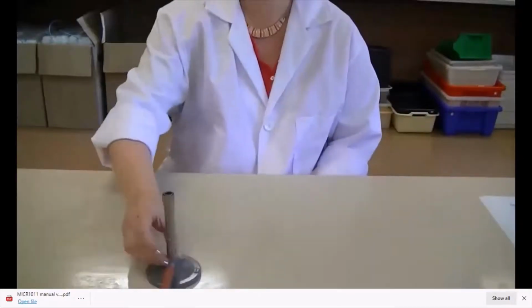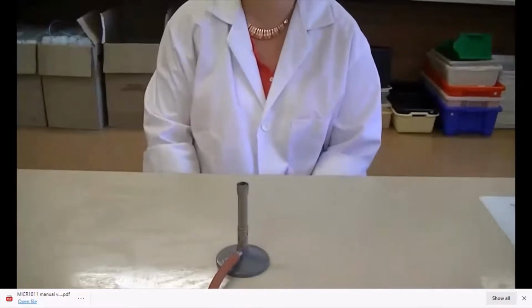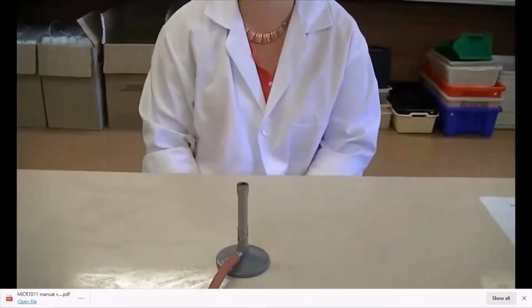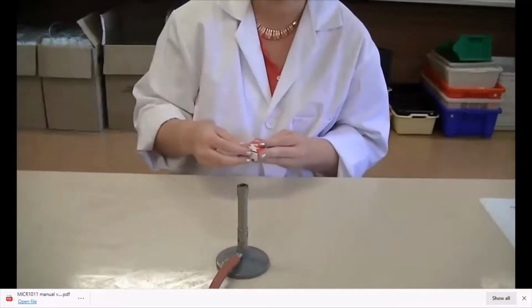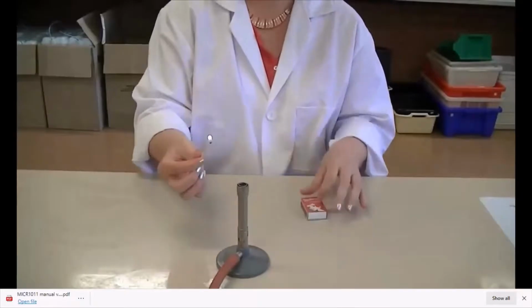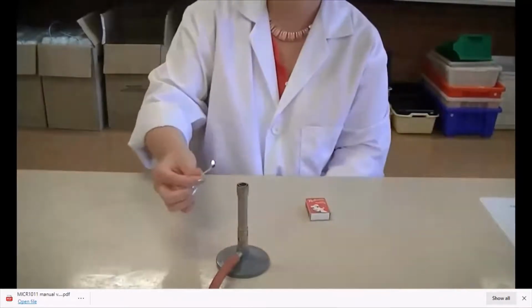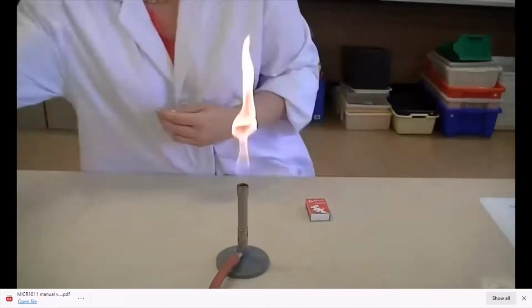A key piece of equipment that you need to use to create a sterile environment is the Bunsen burner. When the Bunsen is lit, the flame creates an area of sterility in the air and also keeps the bench nice and clean as well. So you want to light that soon after you've wiped your bench down. Grab your matches, strike your match, and ensure that the hole of the Bunsen is closed, and then you can turn on your tap. You should hear the gas coming out, and then you can light your flame, and your match can be disposed of in the pipette bucket.